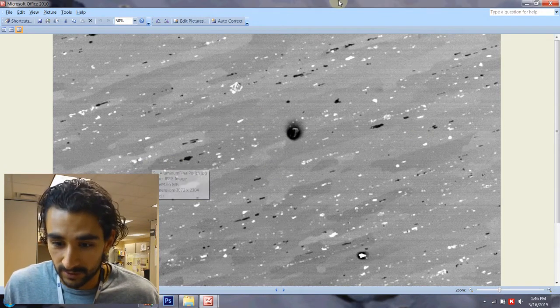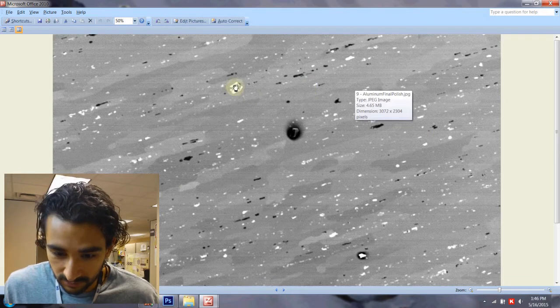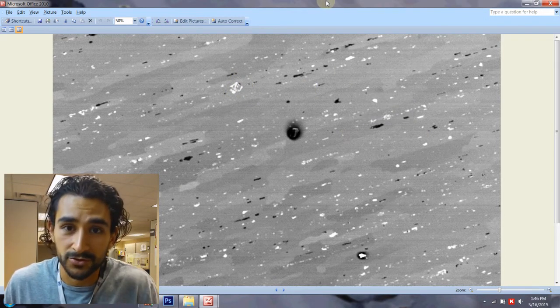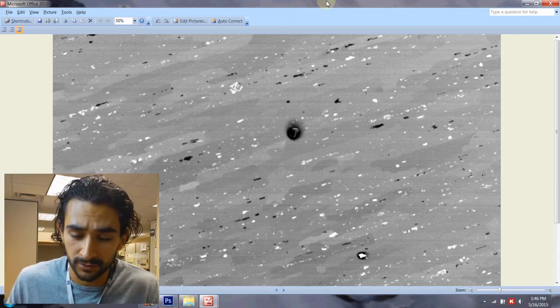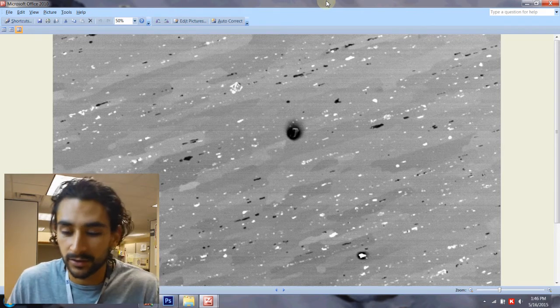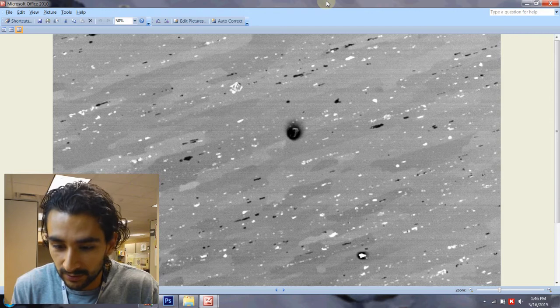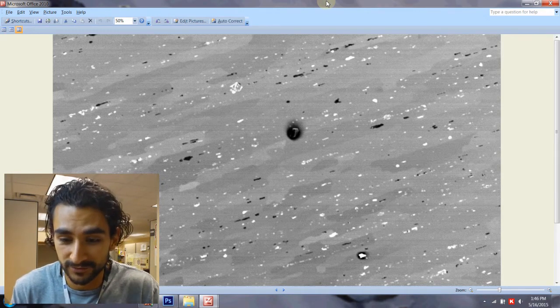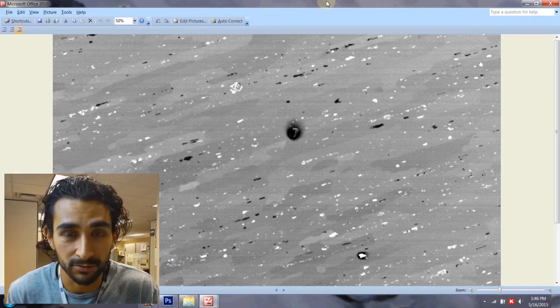This is where it's very important to know what your sample is. In my case, I just wanted to show a piece of aluminum, so I grabbed just a random aluminum block that I found. But now I really want to know what it is because if these are precipitates, this must be some kind of dispersion strengthened alloy aluminum. I did not know they made those. Or maybe they're just polishing particles that shouldn't be there. So very important to know what your sample is made of.